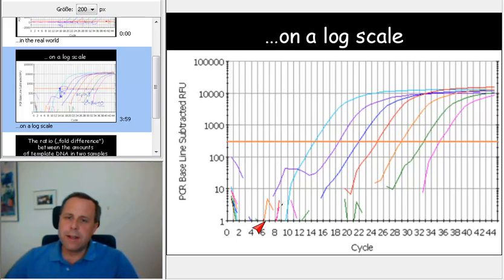This level is close to zero and if you try to take the logarithm of zero your mathematics teacher will become mad at you because you are not allowed to do that and if you still try to take the logarithm of a very low number you reach very far into the negative numbers. So this is what the machine is trying to do here and that's why this is becoming such a mess. For practical purposes you can ignore all that down here.